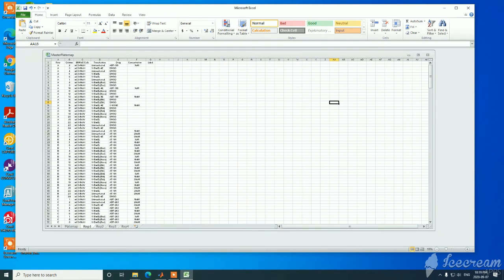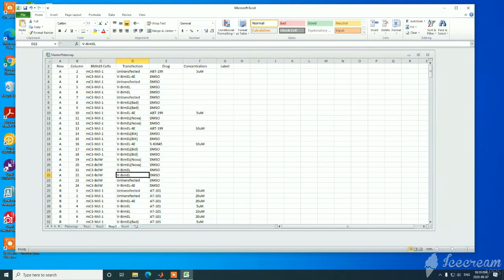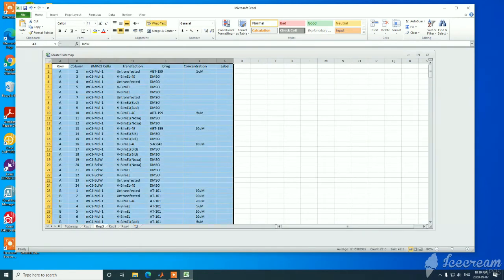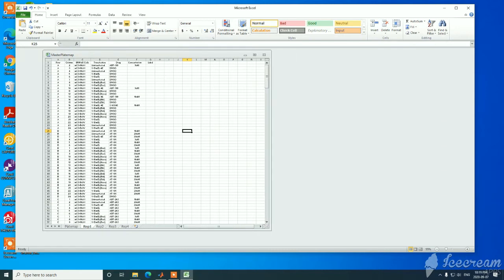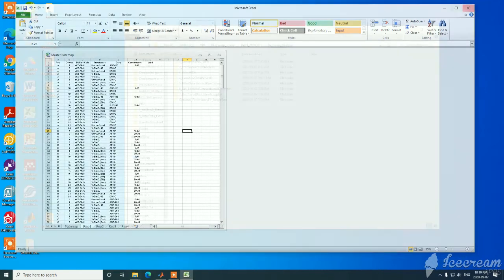We have the option to put replicate 1, 2, 3, 4 in case there's any differences made in preparing that plate. We give the option to do that, but if they're all the same as replicate 1, which often happens, you can use just one sheet for the analysis in your master plate map. Okay.